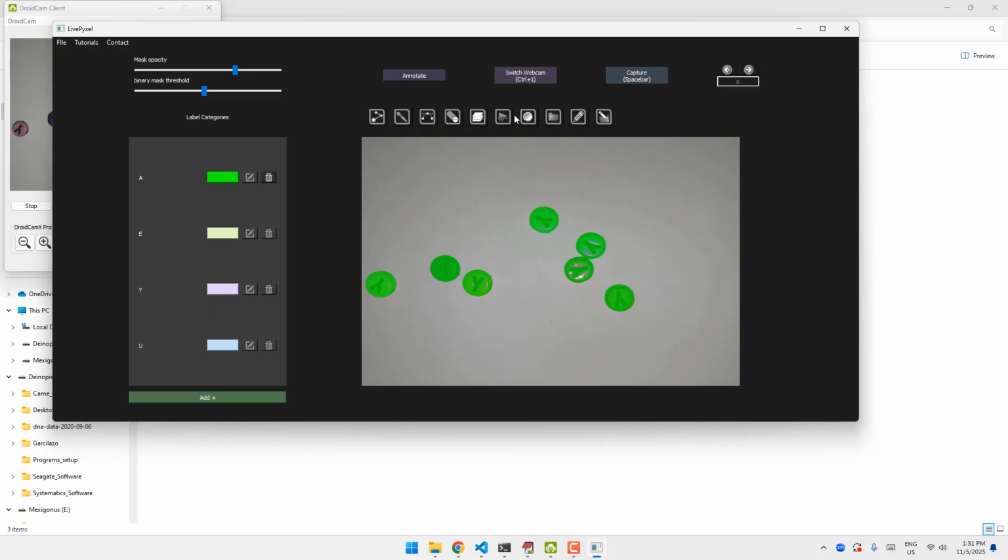I click on the magenta color, I turn off the boolean and bring back and select the desired color. I'm gonna add a bit of extra filling here to these annotations. And then I click annotate.